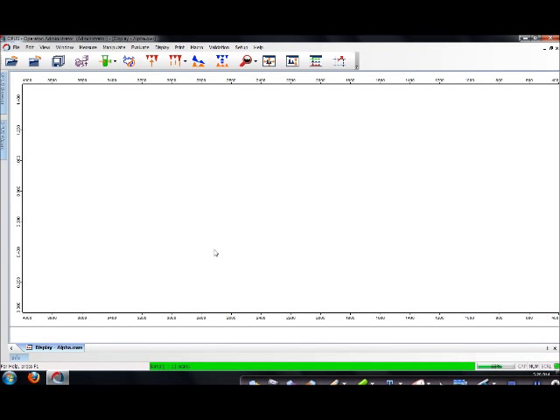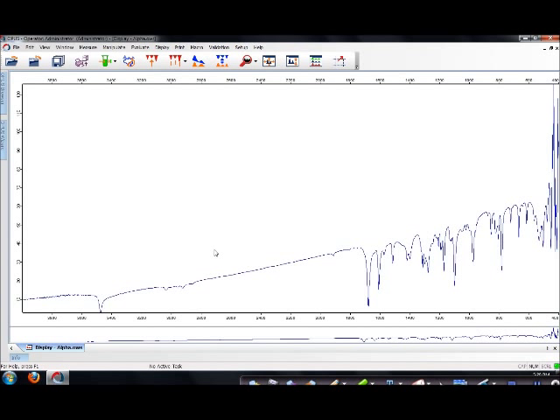Hold on for a while and wait patiently. And voila! Your IR spectrum is up.